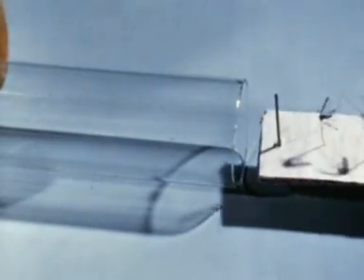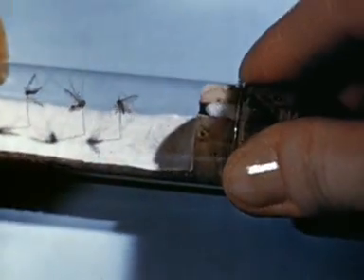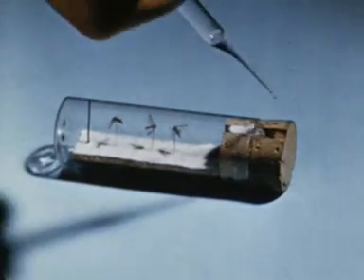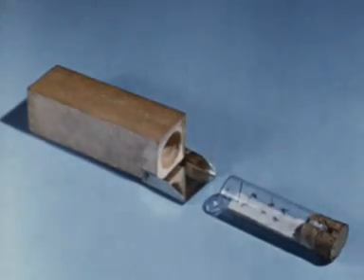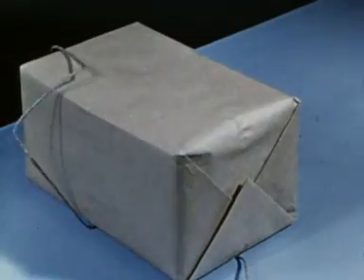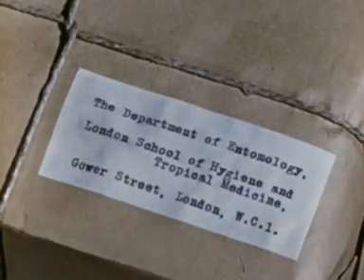For sending specimens through the post, a glass tube is sometimes used. The insects, which have been pinned but not staged, are mounted on a cork platform covered with white paper and attached to the cork of the tube. The platform is shorter than the tube, and this, with the spacing pin, keeps it from buckling during transit. Notes may be made on the white paper covering the platform. The preservative is added to the cotton wool in the V-shaped slit in the cork. Then the tube is put in a wooden container, and this is carefully packed in wood, wool or similar material, to cushion it during its journey. Somewhere in the parcel too, full details of the specimen should be included. Undoubtedly, much time and labour will have been spent in collecting the specimens, so it is well worthwhile to mount and pack them with care, for this is the only way of ensuring that they arrive at their destination in perfect condition.